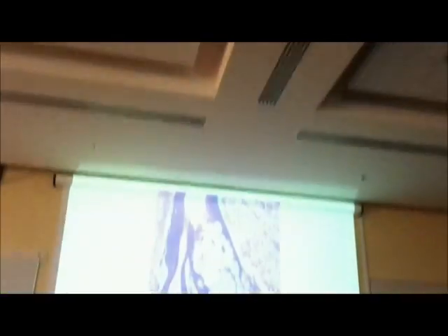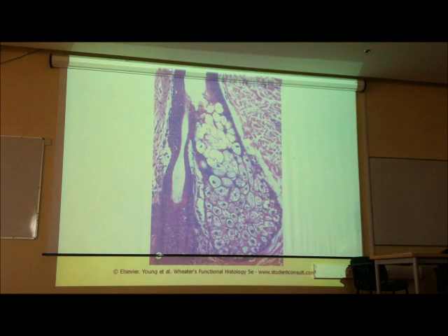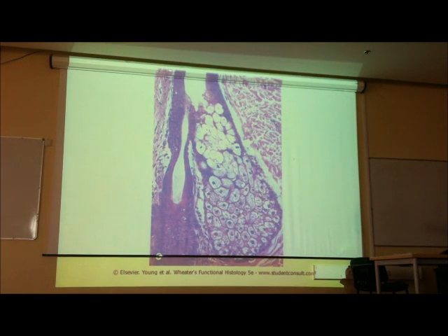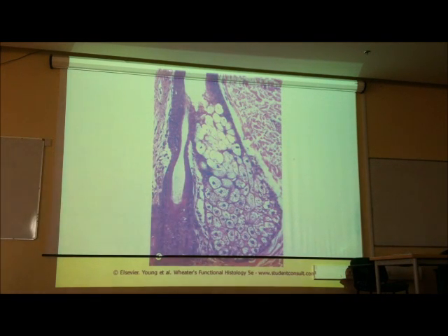Yes. What are these empty spaces? Dissolved lipid. What is the type of simple alveolar or simple branched alveolar which secrete an oily secretion? Sebaceous gland. Okay? Look to the next one.